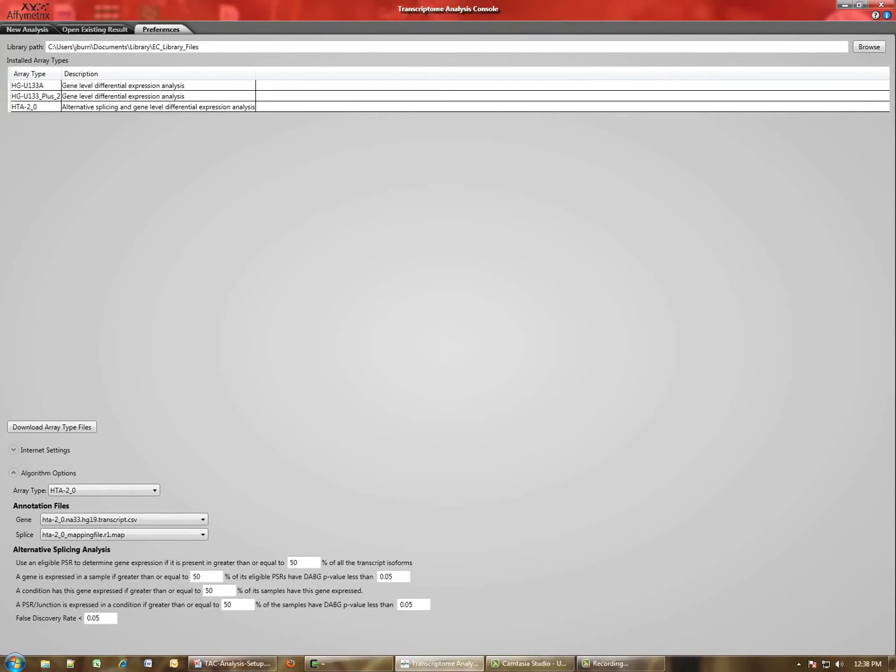For me, I used the same folder that I used for my Expression Console, so I don't have to have duplicate copies of my files on my system, because some of the analysis files are shared between the Expression Console and TAC.